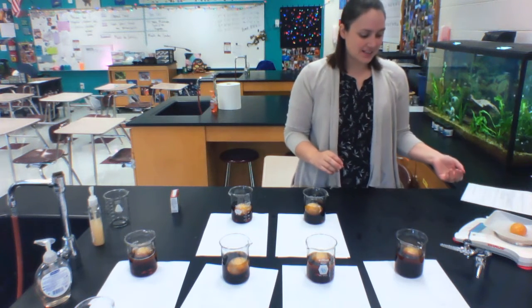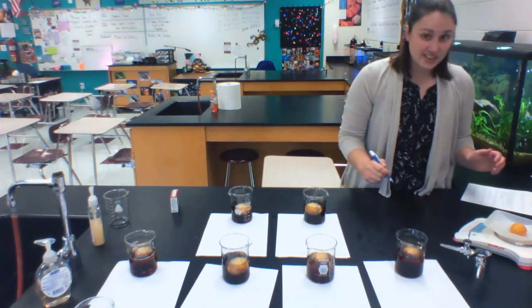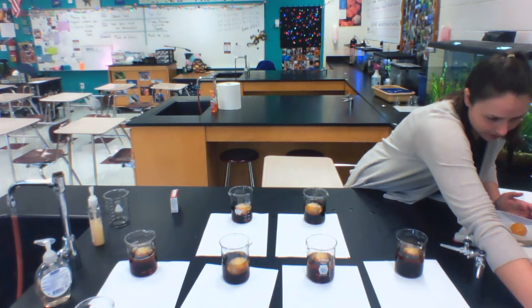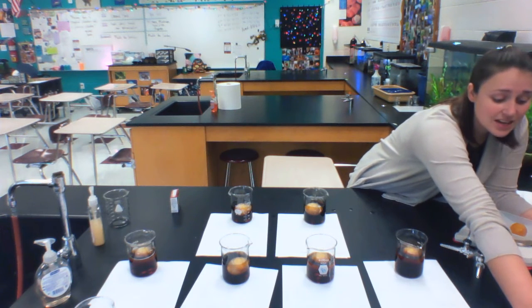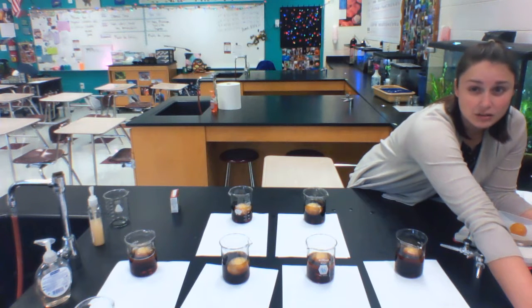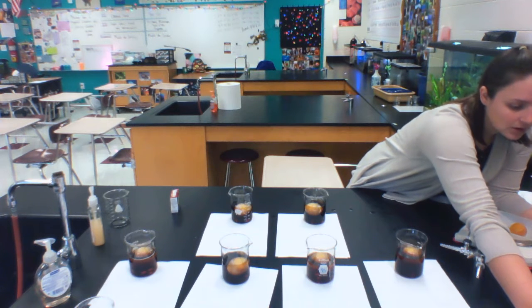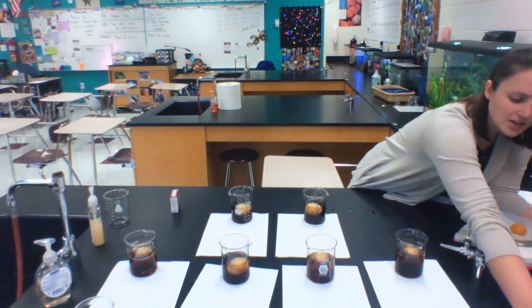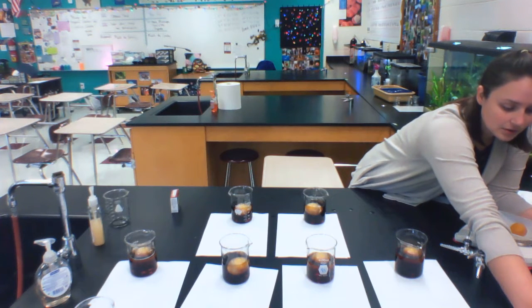Now the mass is 43.50 grams. It lost like 30 grams. That's a lot of mass to lose. So it's at 43.51 grams. Now I'm going to say it doesn't just feel squishy. It is very squishy and really kind of shriveled. And it's also a lot smaller. So I'm recording that. And it is still yellow. You can still see the yolk.